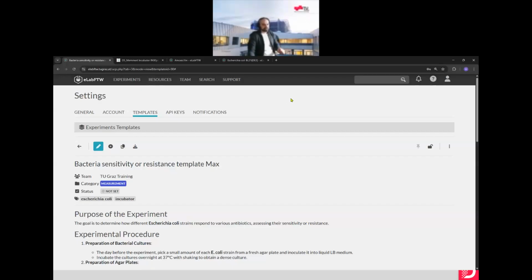So the other thing I want to do is to show you this also from the team admin side. So from the side of the person who created it. And for that, I will just switch things here. So I will stop sharing for a moment.